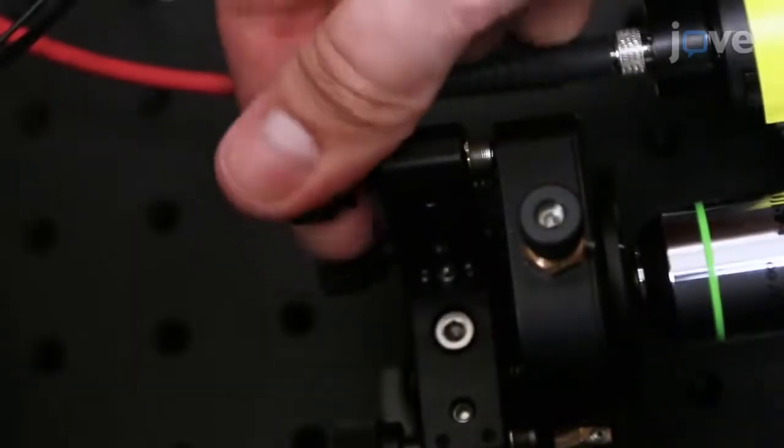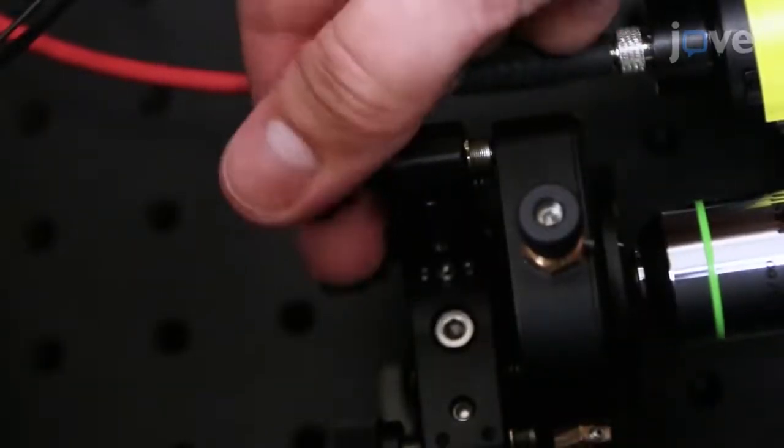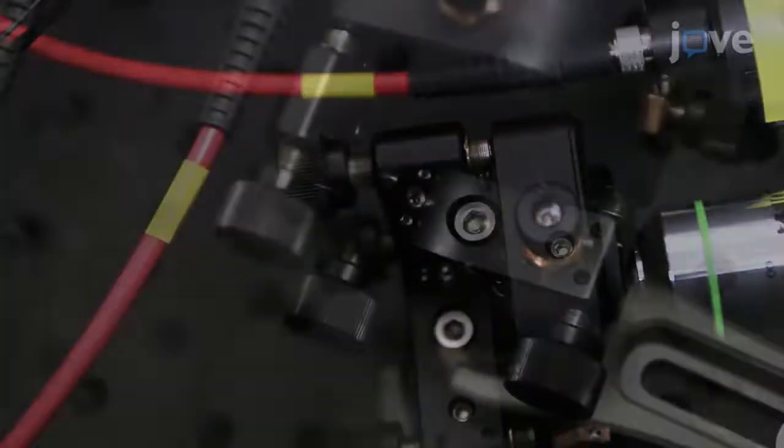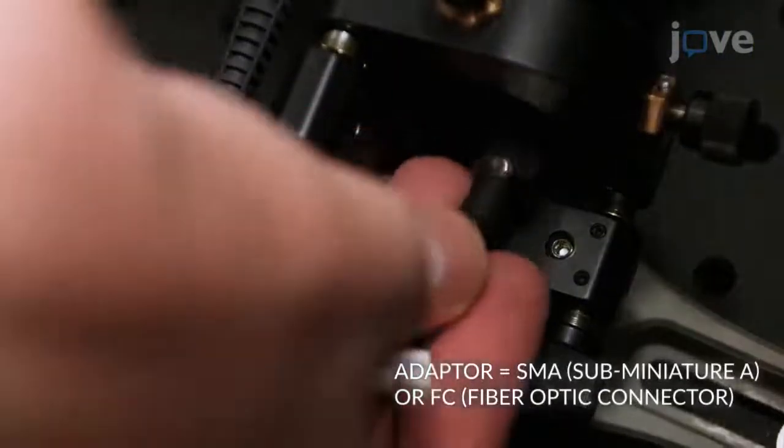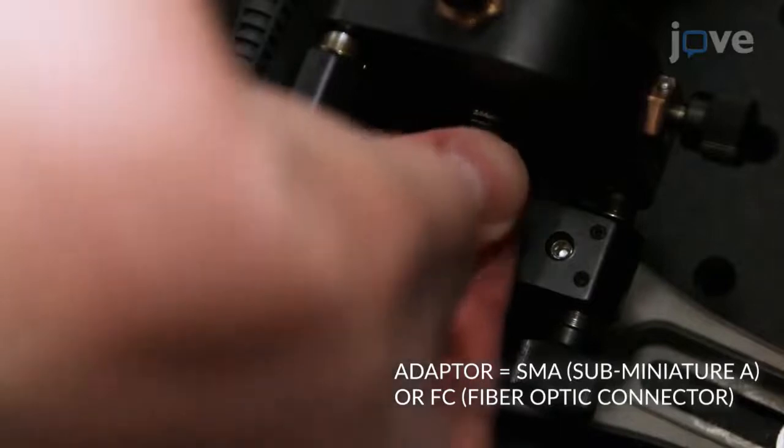Begin by loosening all screws on the 5-axis translator. Screw in the patch cord to the adapter that is affixed to the 5-axis translator.